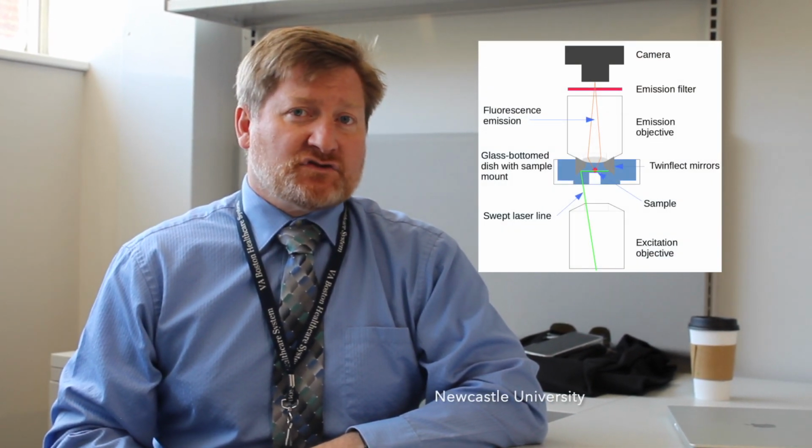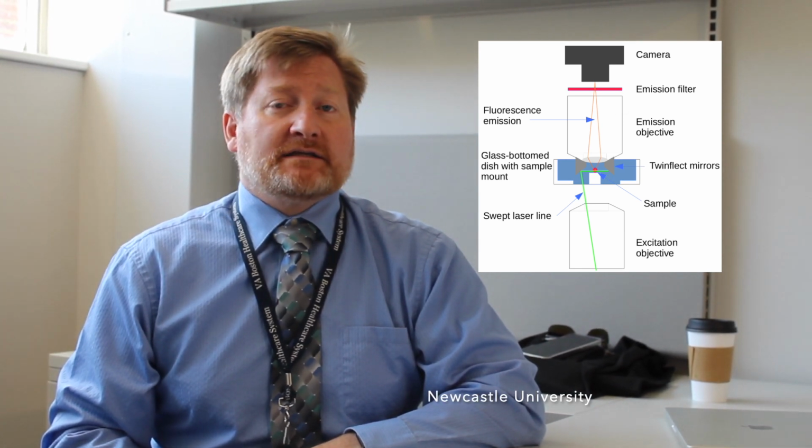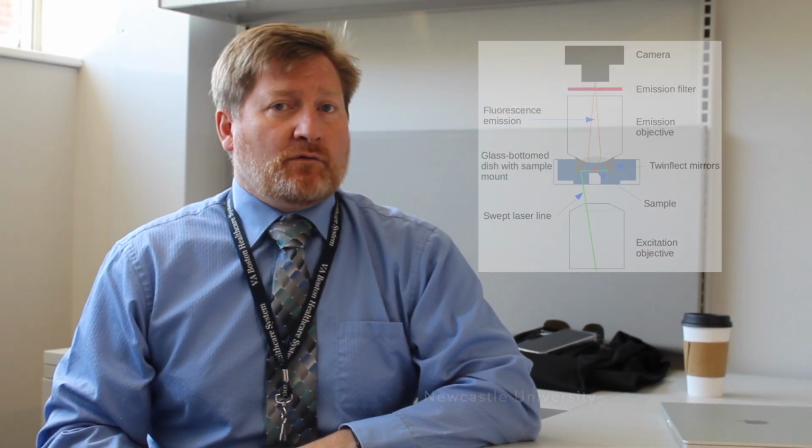So we examine these underneath the microscope and can build a 3-dimensional image of these markers of the different types of cells and pathology. We use really fancy microscopes for this. One of the microscopes we have is called a light sheet microscope, and it basically just sweeps a sheet of light through the specimen over and over again to build a 3-dimensional image. And the other technique that we frequently use is called confocal microscopy.